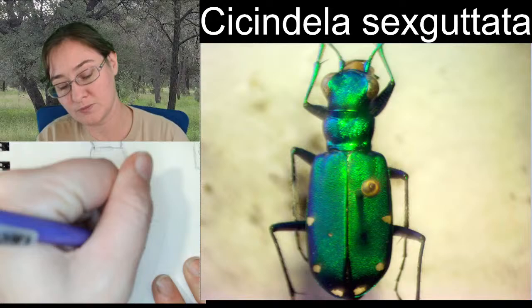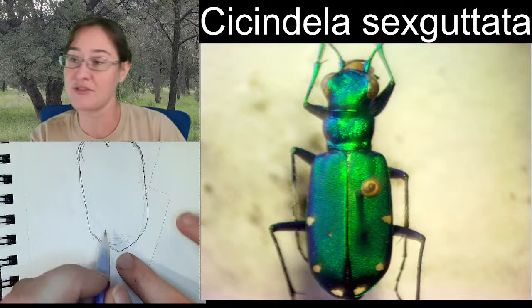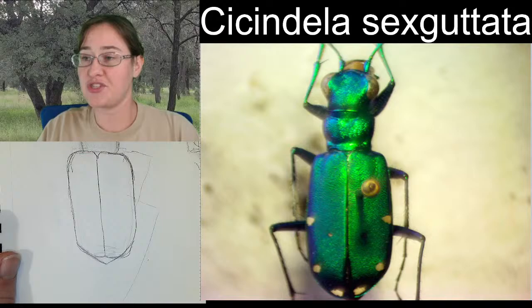So we're coming in this way. And it looks like at the very end of the elytra, instead of meeting really even and rounded, it kind of comes down to this point down here. And I believe that is the end of the abdomen. So the elytra actually continue this way. So it's kind of like this, where the abdomen sticks out a little bit after the elytra. We are going to be able to zoom in on that when we're finalizing this here. But that's about what my light sketch is going to look like.